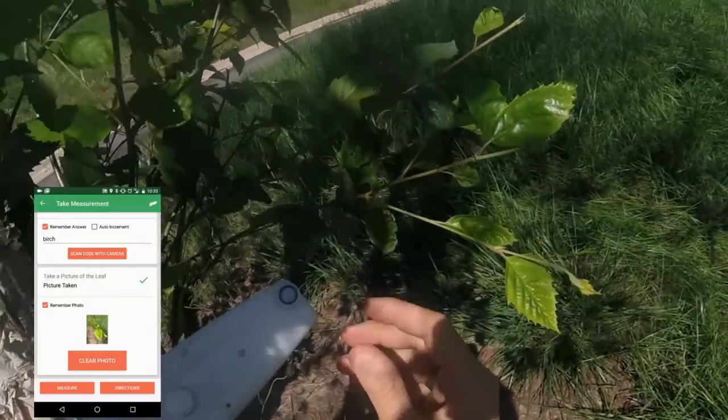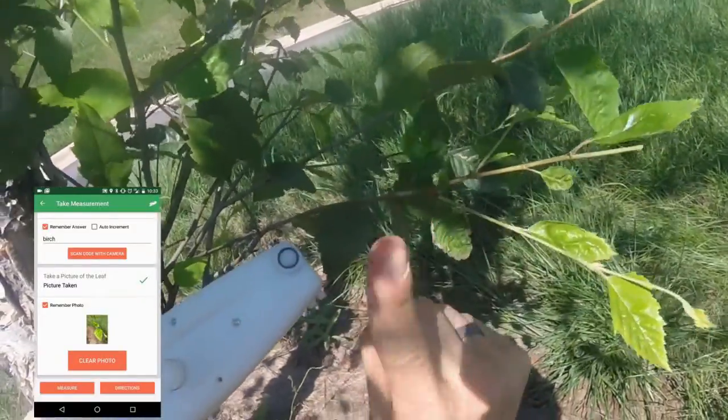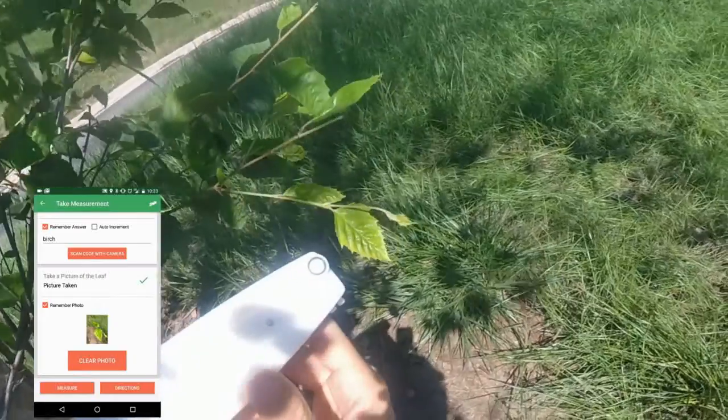2. Don't move or disturb the leaf from its natural position. This also changes the light intensity experienced by the leaf and can affect the photosynthetic response.